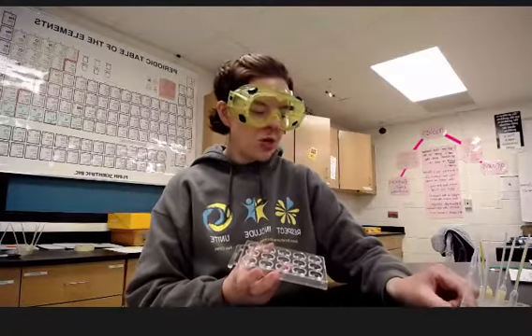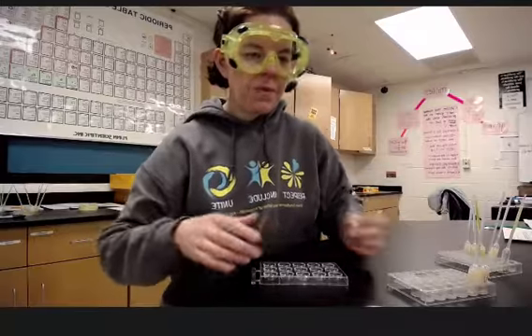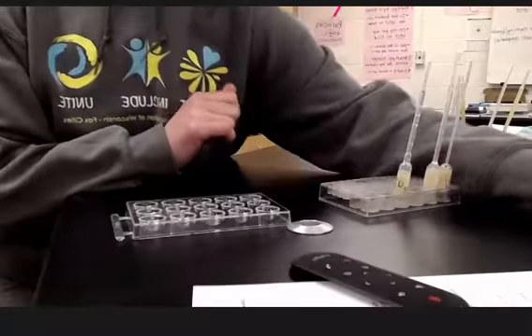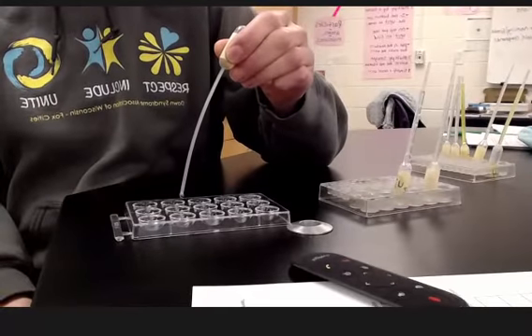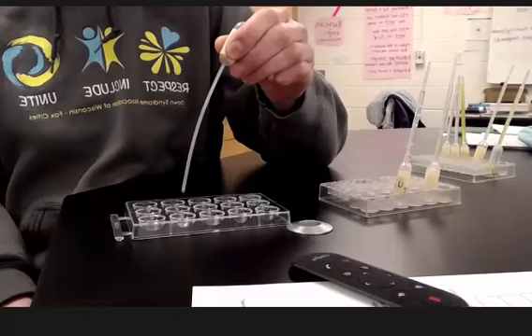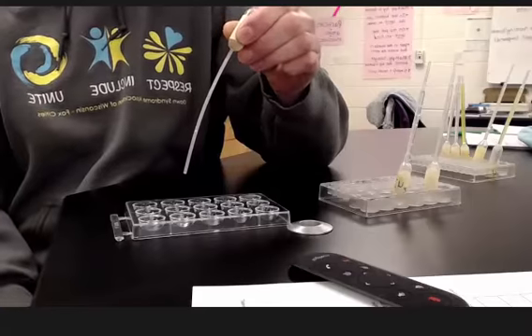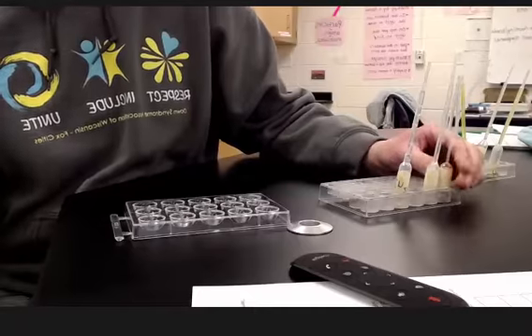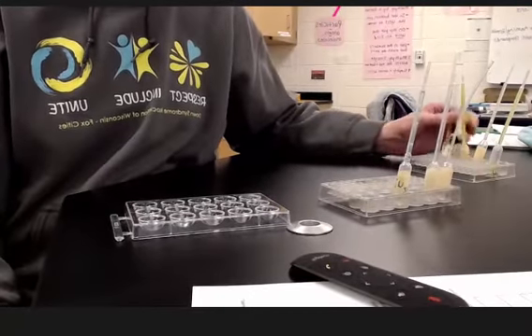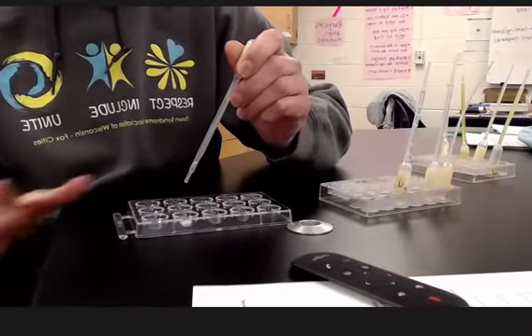To do this lab, you're just going to take a couple of drops. Do it flat on the table. I'm just going to adjust my camera so you can see here. Okay. So you're going to take just a couple of drops, like 2 to 3 drops of your first solution. Now, when you drop these in, it's really important you do it from up above so you don't contaminate the dropper. If you touch the tip of your dropper into your solutions, you'll contaminate it, and then it'll be a mess for every lab. Okay, so a couple of drops of that with a couple of drops of our next solution. Okay, this is our anion solution.